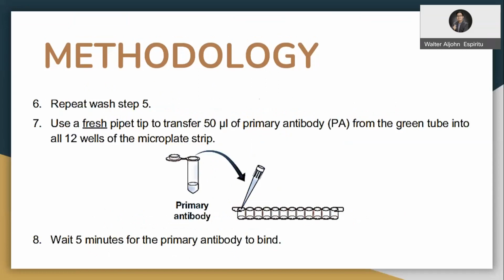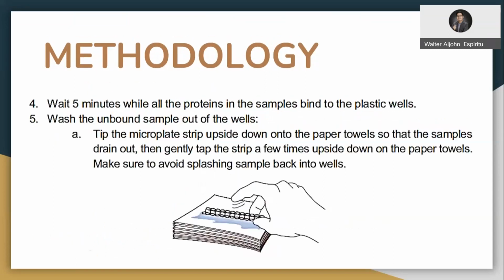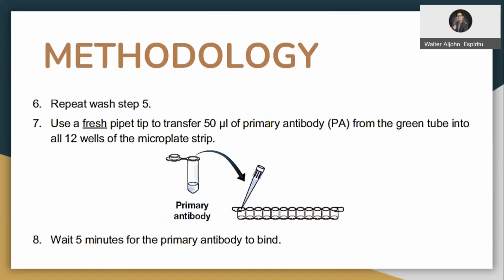Then the next thing you're going to do is repeat the washing, at least twice, to make sure that all of the excess samples have been removed.